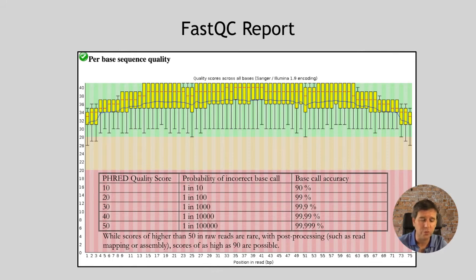So that gives us this short read length limit that we have with Illumina sequencing here, and we see this quality is still pretty good right up to the end of these reads in this particular example. So we're happy to proceed.